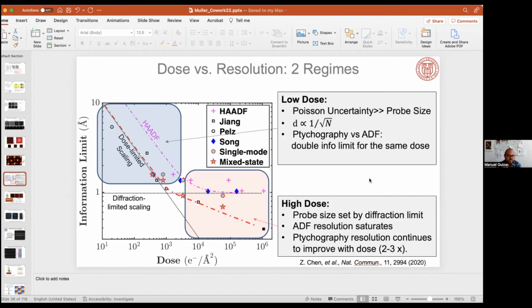And you mentioned a depth resolution that you managed to get of 3 nanometers, and I was wondering, how is this 3 nanometers compared to the depth of focus, or you called it another name? It was a potential, strong phase approximation, I think, something.